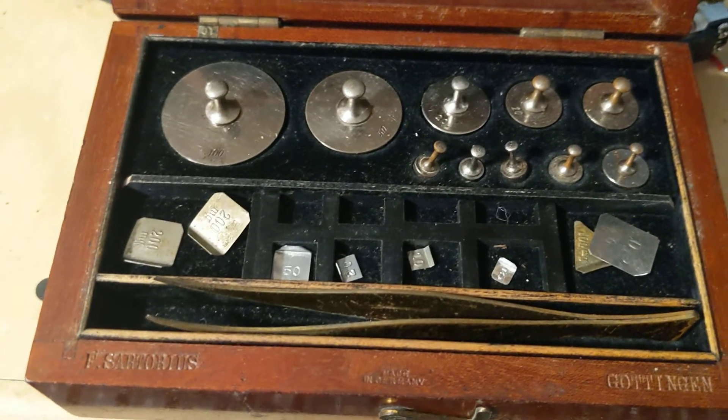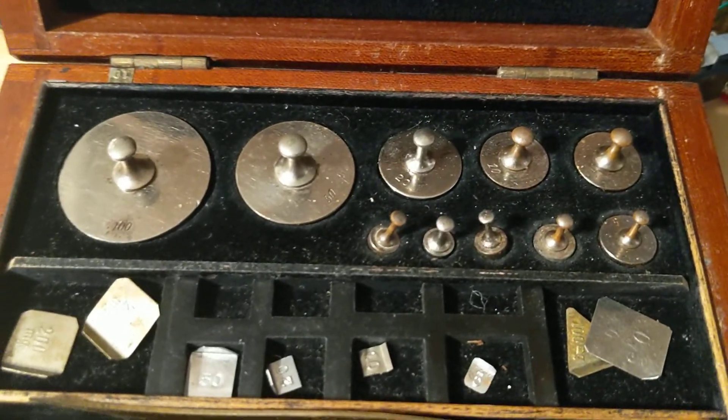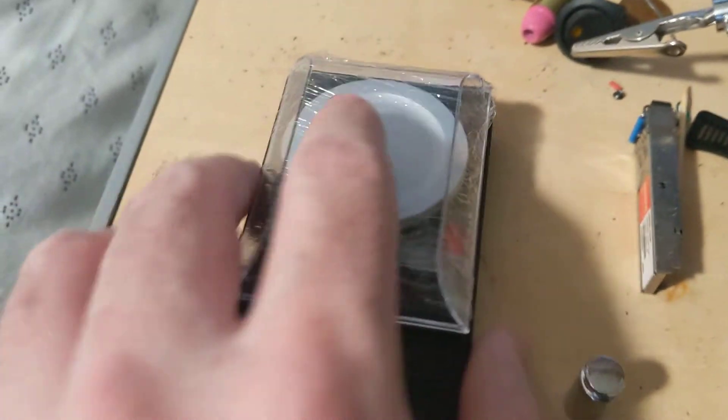Hi everybody, time for another short scale update. I got some goodies in. First off, I got some check weights in grams, and then I've got a Waboo 10 gram scale.